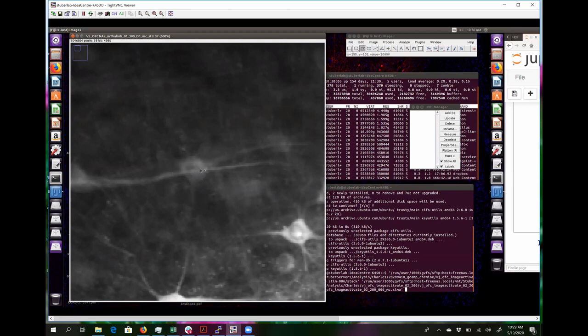So then I would say, well, every portion of the cell that's above this dendrite seems to be good and is part of that cell. So that's what I'm going to use to draw the ROI. So I'll say everything that's in these pixels, everything that's in those pixels, I think are part of the cell.